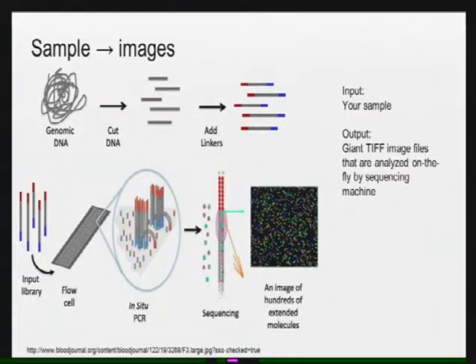And then it does the sequencing procedure where it goes through and sequences the clusters, and as it adds a base, there's an imaging process where each base is going to release a color, and then it's going to successively take images at each step. So at each step when you're adding a base, you're going to get an image and then another image. And that's the raw data that we get from the sequencing, is just these images. And the images are just showing you the color that's coming from each cluster.